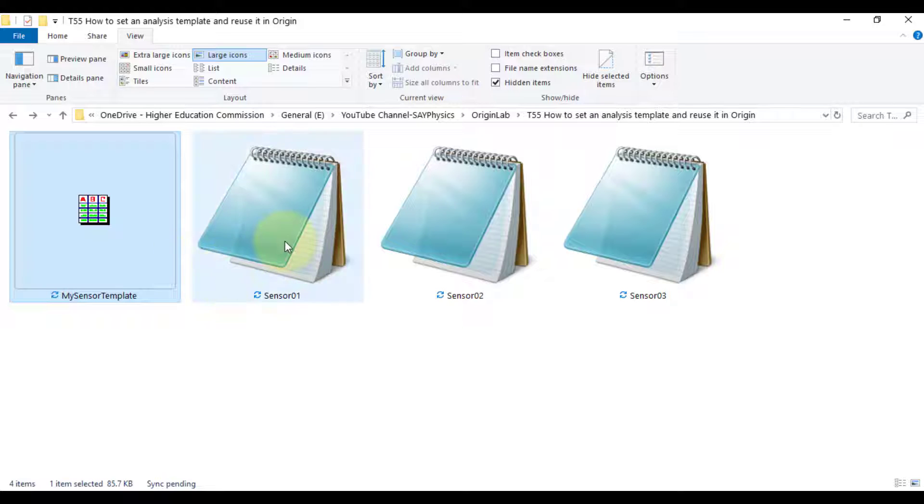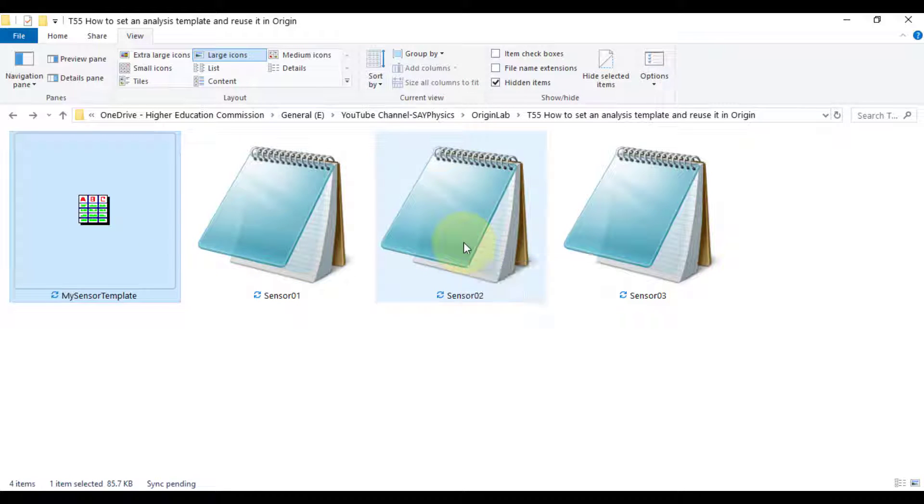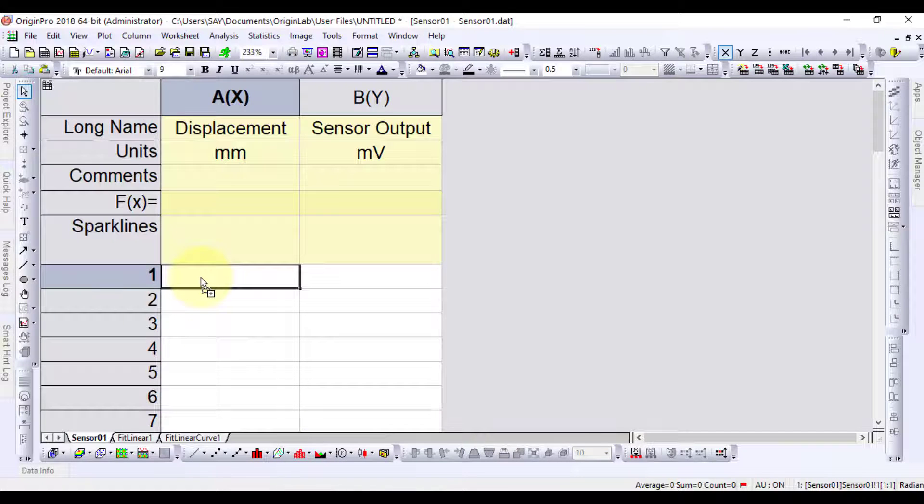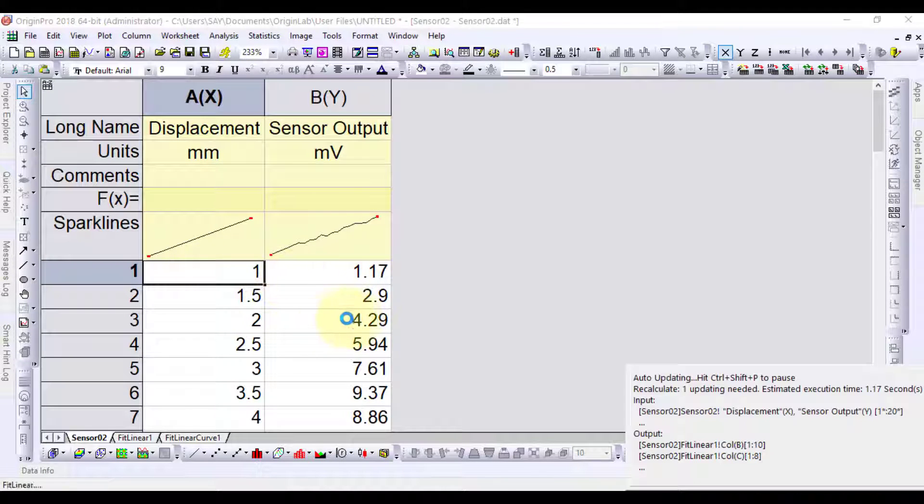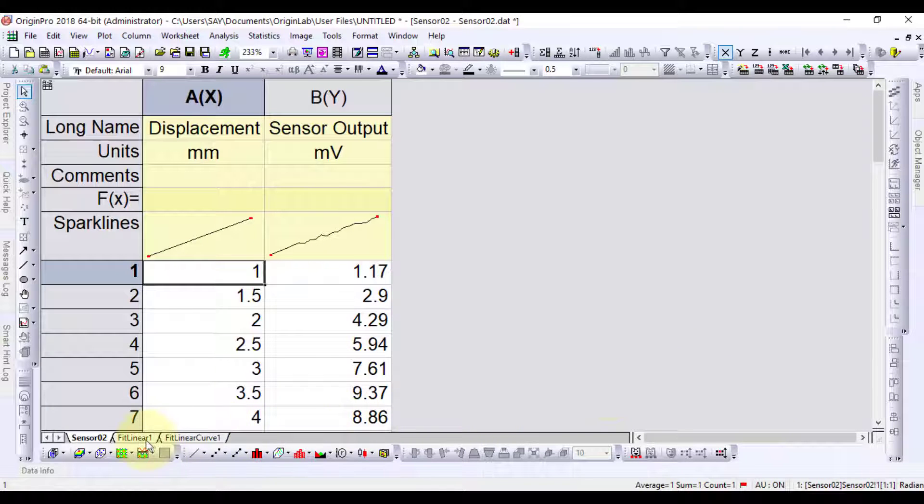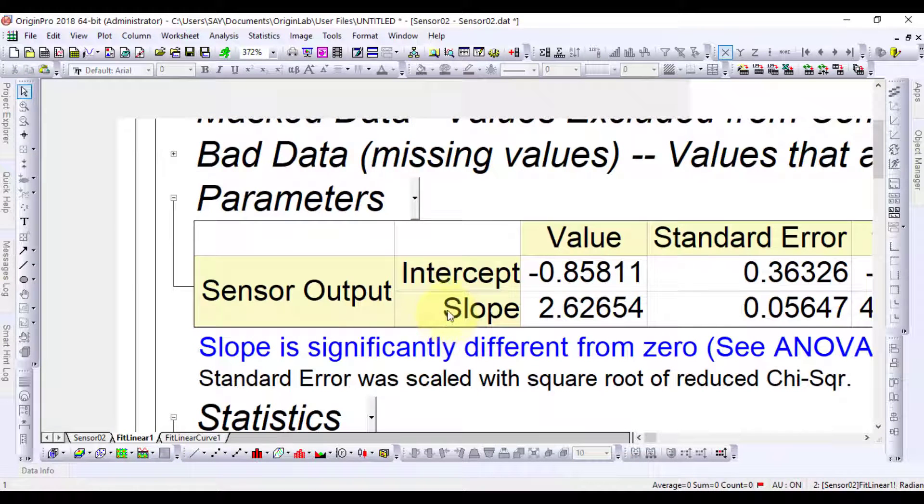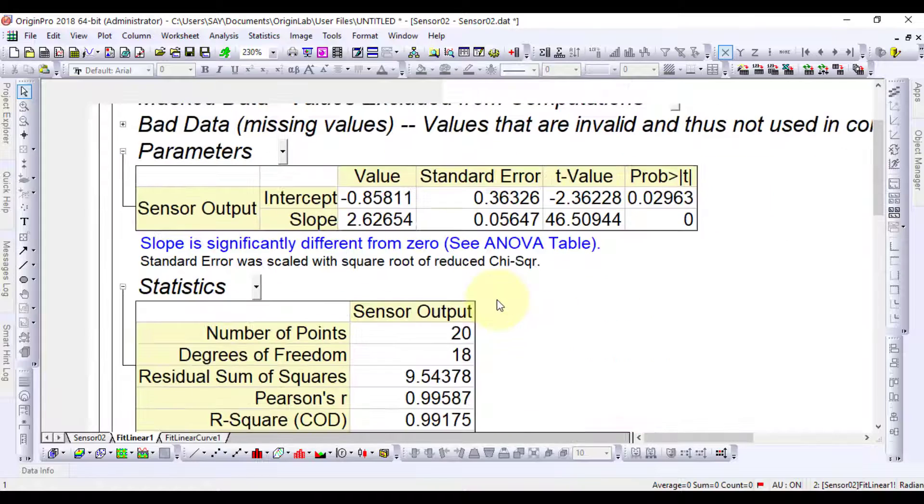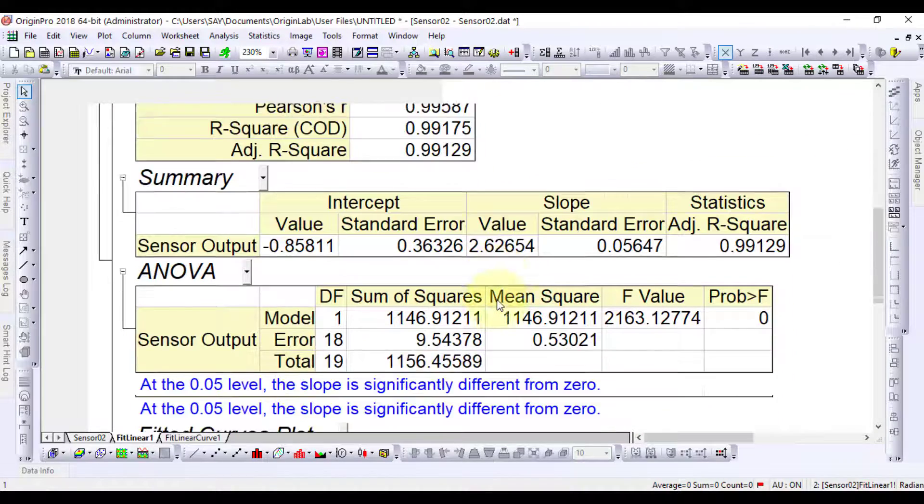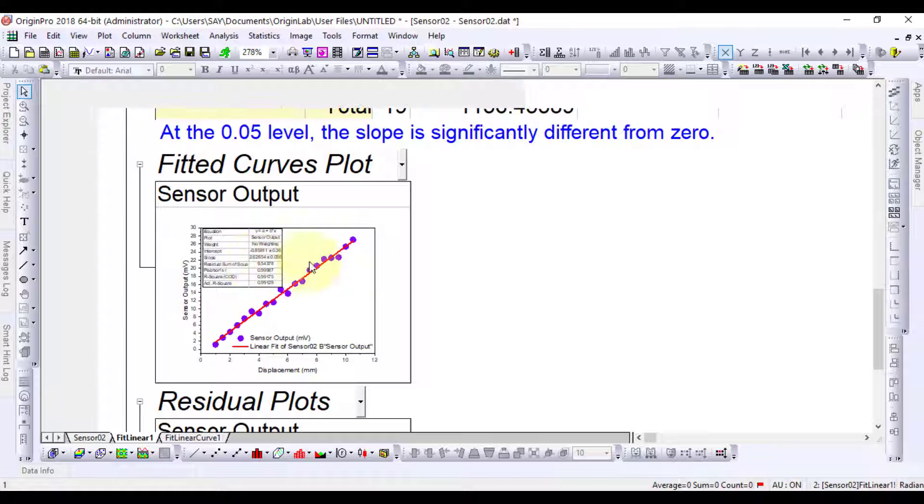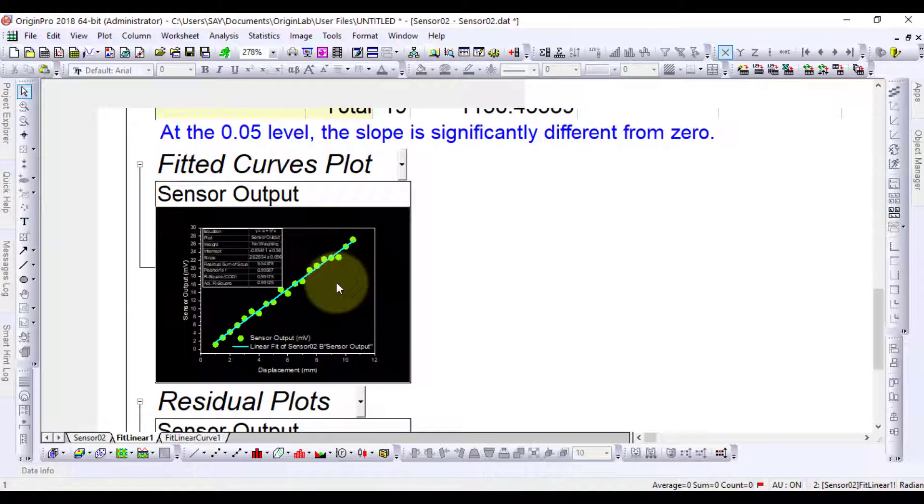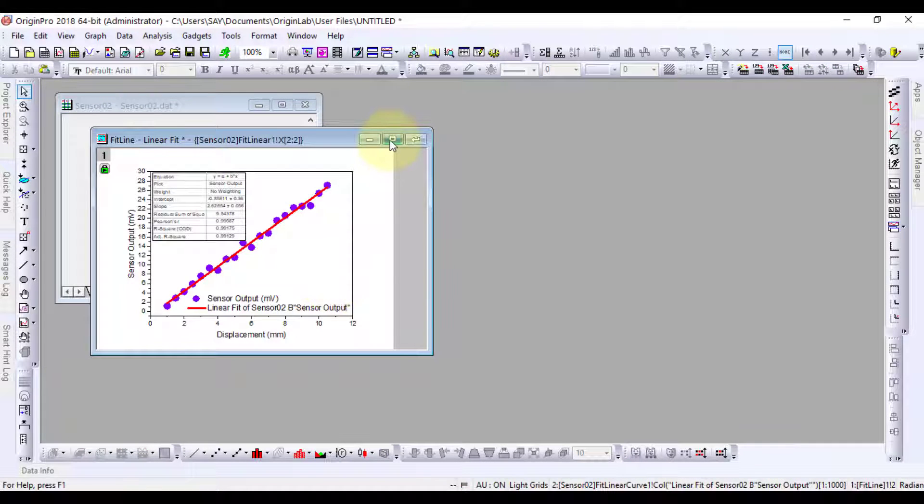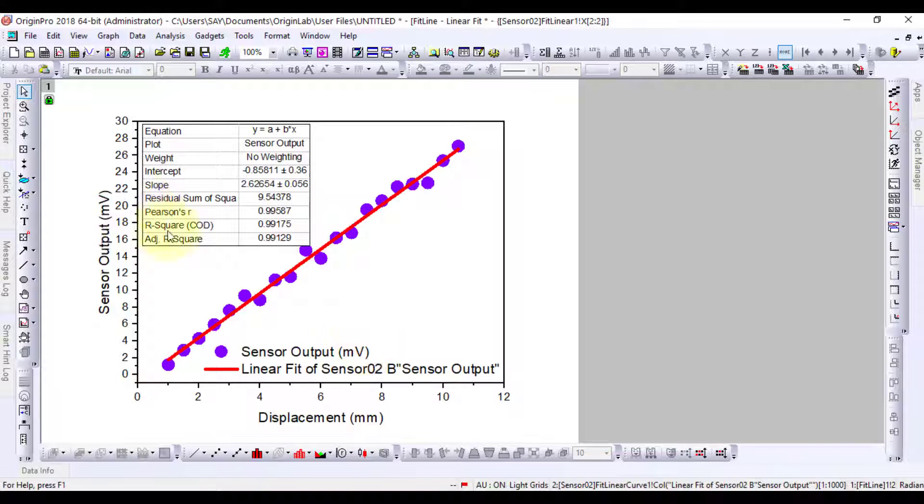Let's import the sensor 2 data to the template. The template will automatically do all the steps we did earlier for sensor 1 data. This has plotted the data with all the required parameters. We can export the graph or save the project.